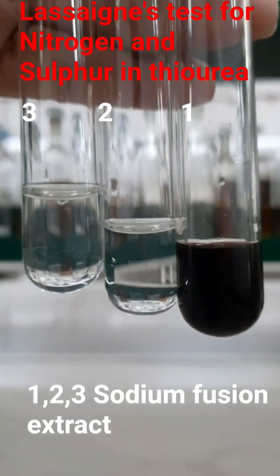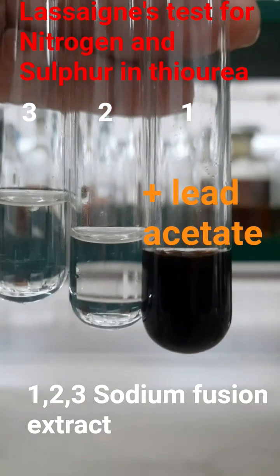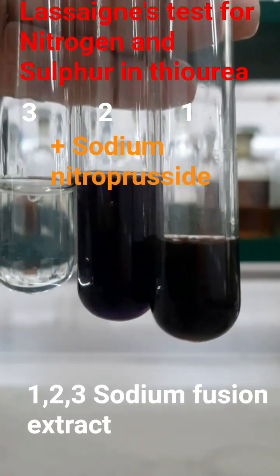In three test tubes containing sodium fusion extract of thiourea, in the first test tube I have added lead acetate solution. The appearance of a black precipitate is due to the formation of lead sulfide.